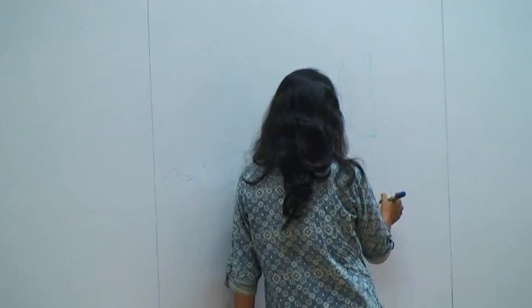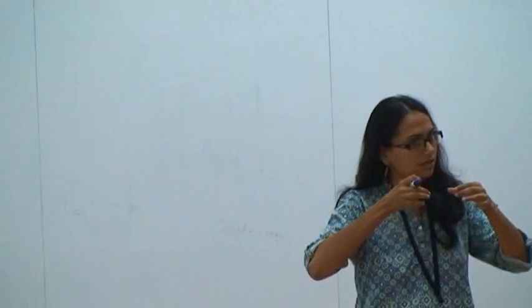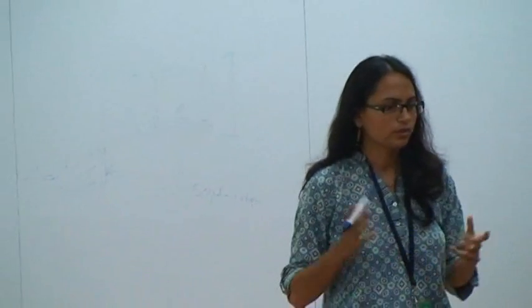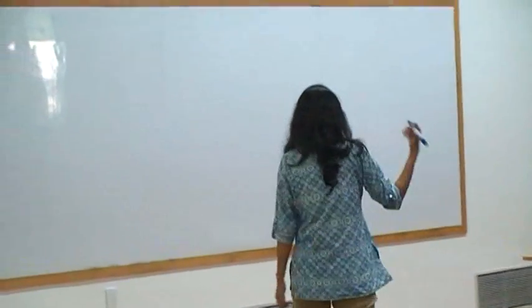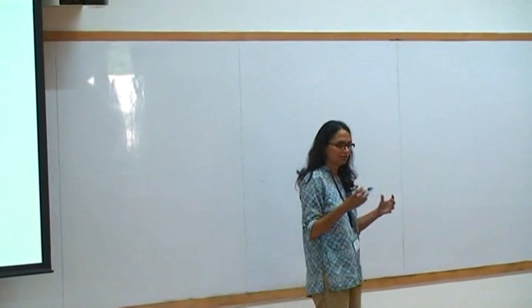From 50 microliter to 100 microliter. These are the volumes which that little thing can take. Now you might wonder, why can't I increase it? This is too difficult to work. Again, the question that Jiku had also asked was, how much can you handle?